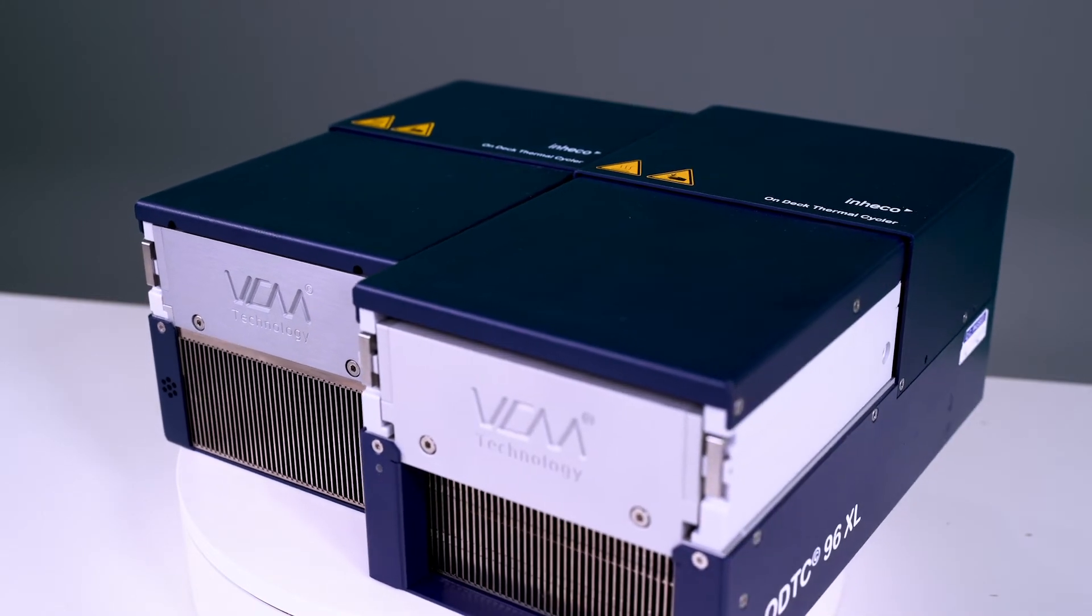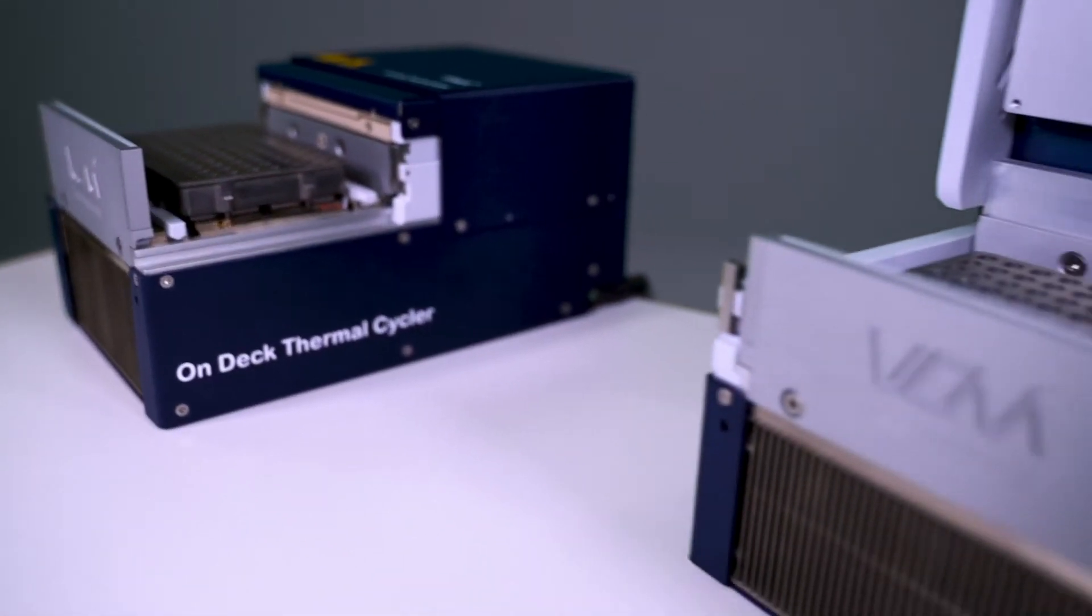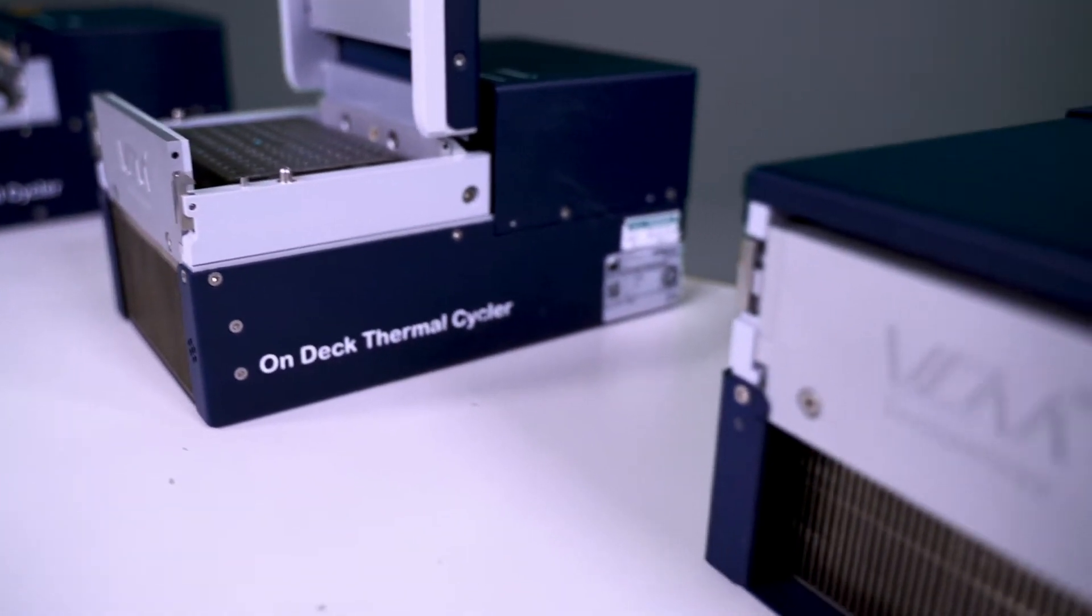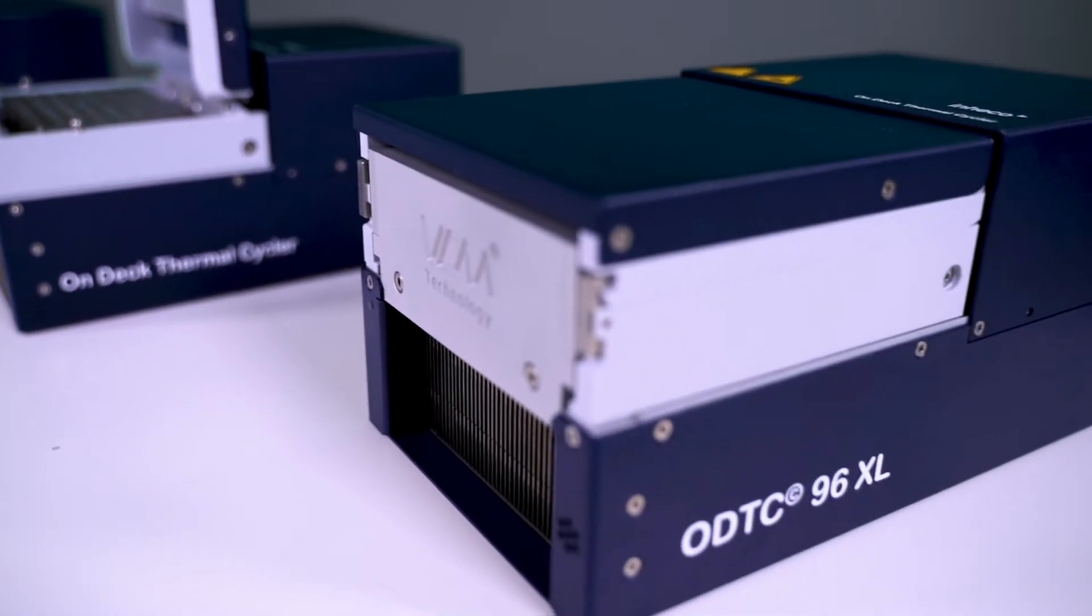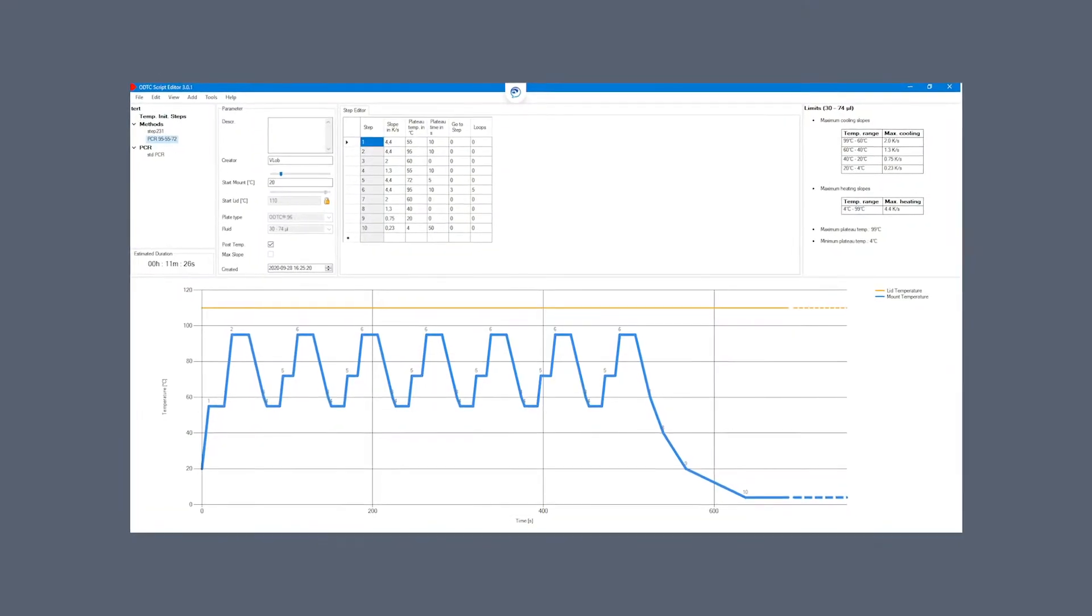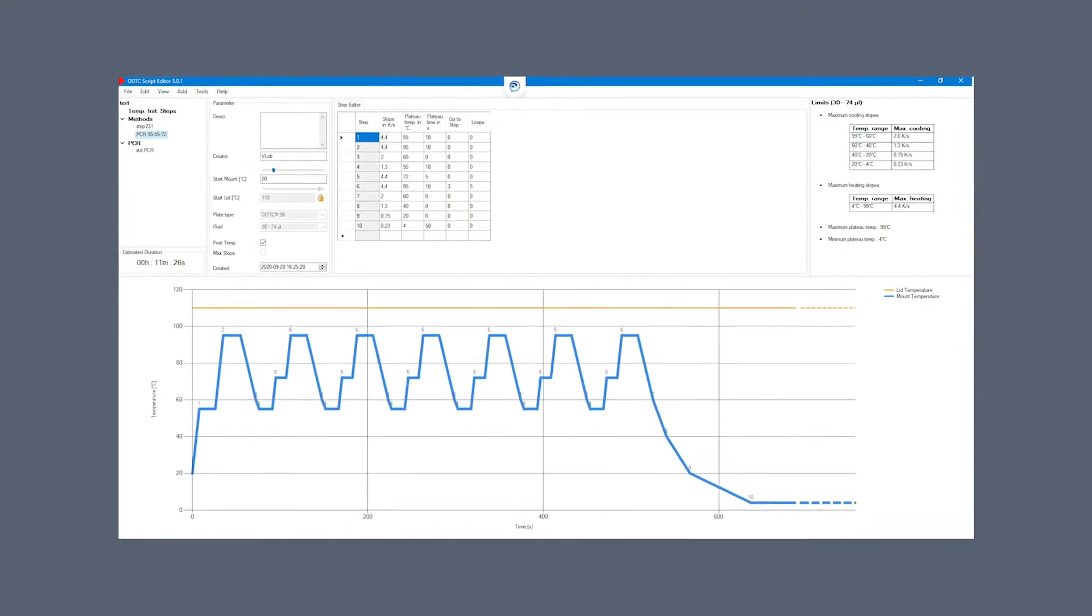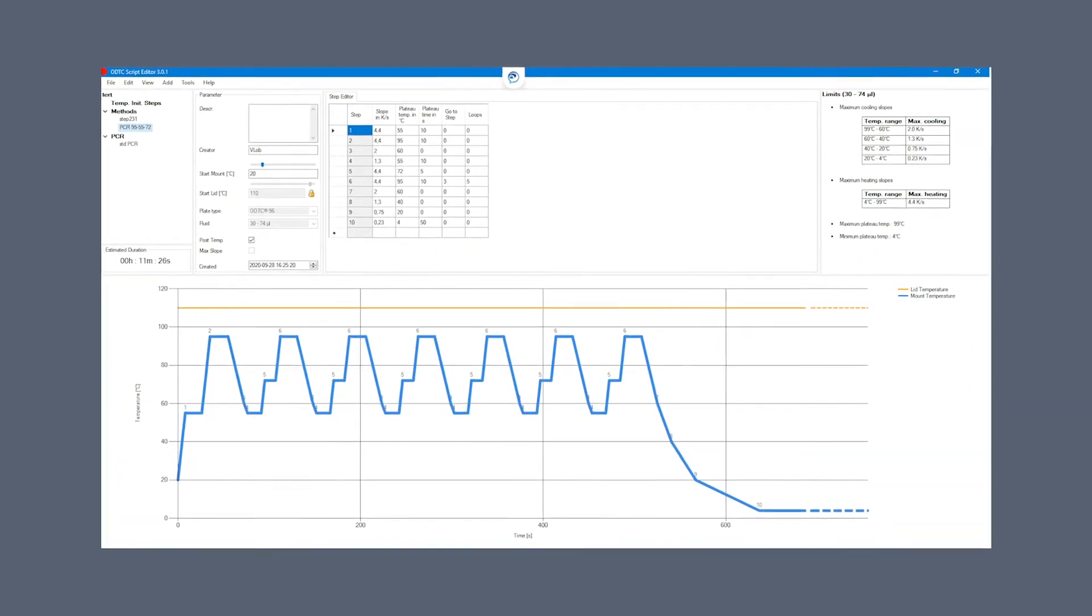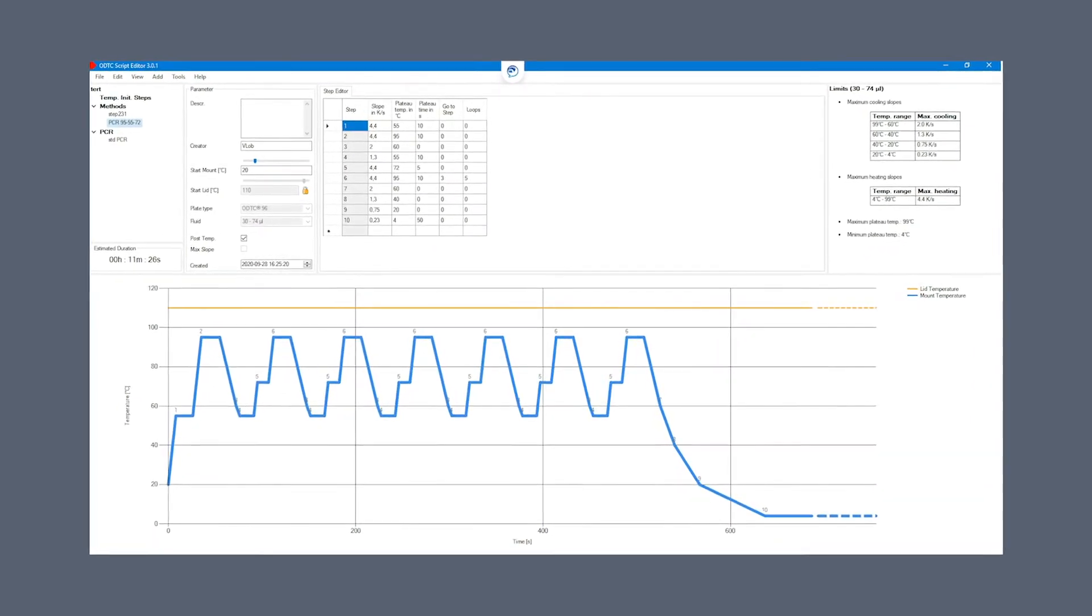Regardless of your choice, our range delivers near identical performance and accuracy across the entire temperature range. Not only the smallest, the ODTC provides excellent performance. Compared to competing products, it takes 20% less time to reach plateau temperature.